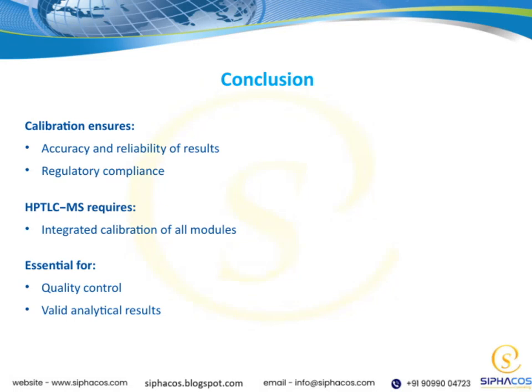So, in conclusion, I want to emphasize that calibration plays a crucial role in ensuring the accuracy and reliability of our results. When we calibrate properly, we can trust that the data we generate is solid and consistent. It's also essential for maintaining regulatory compliance, which is vital in our industry. Now, especially with HPTLC-MS systems, calibration becomes even more important because it requires the integrated calibration of all modules involved. This integration ensures that every part of the system works harmoniously, providing us with precise and valid analytical results.